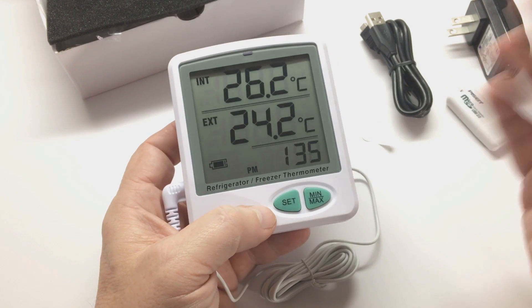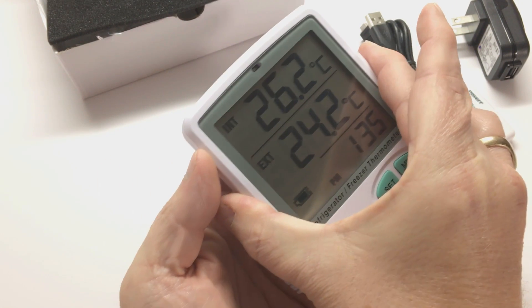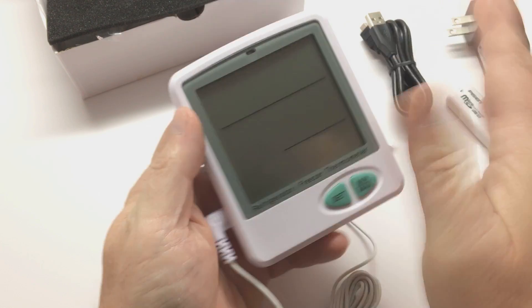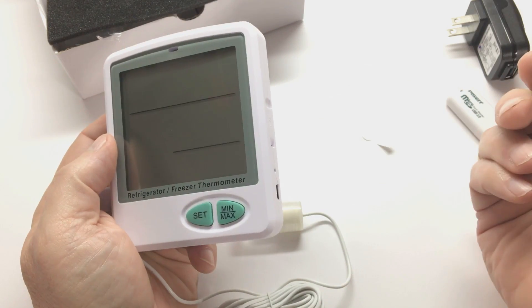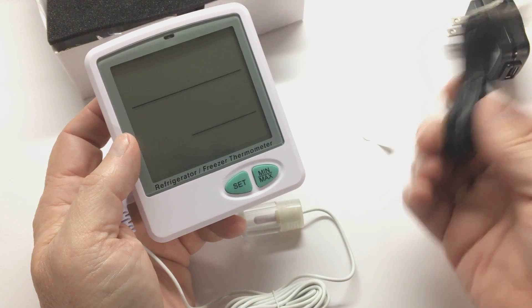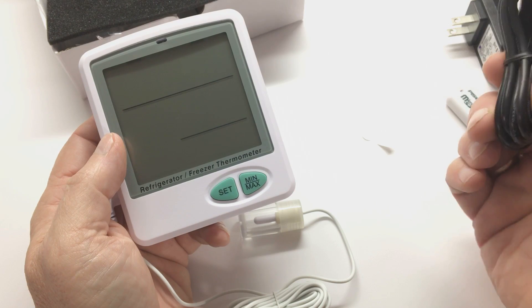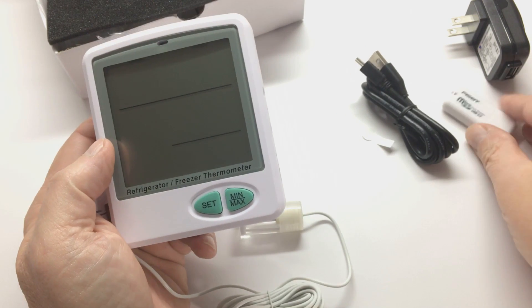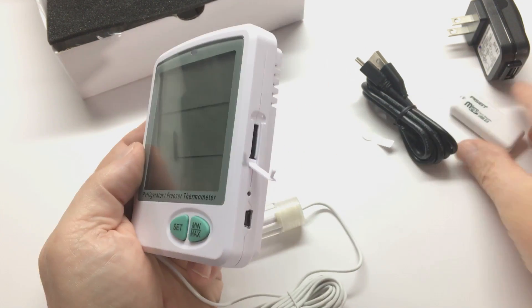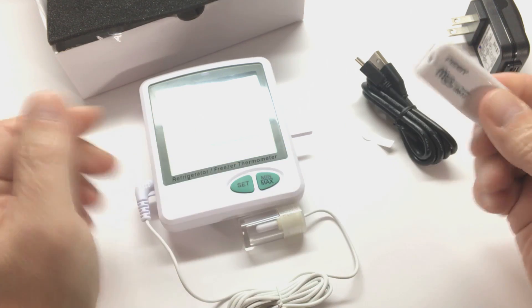At that point, if you want to download your records, turn the unit off by pressing the on/off for a couple of seconds until the display goes out. Connect your USB cable to the side of the unit, plug it into your PC, and turn it back on. A folder will appear in your computer. Open up that folder and inside is an XLS Excel spreadsheet file you can open to retrieve your data. Alternatively, you can remove the SD card, put it into a card reader, and insert that into the USB port on your PC to get your data that way.